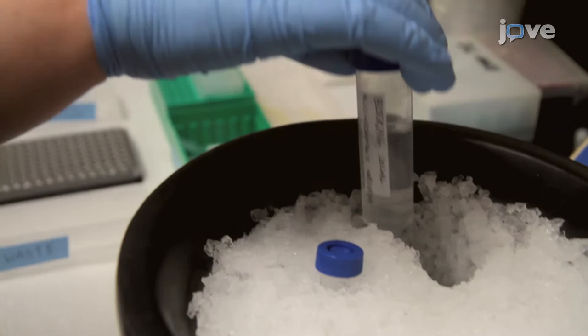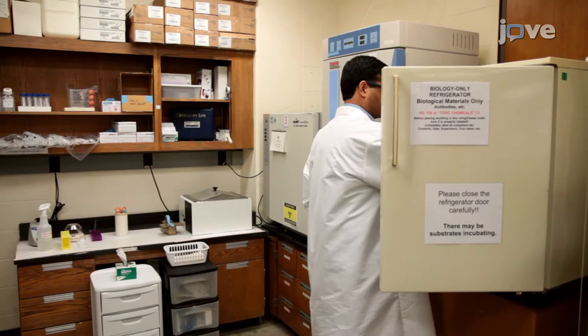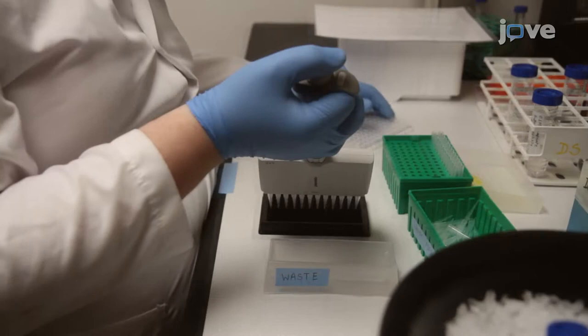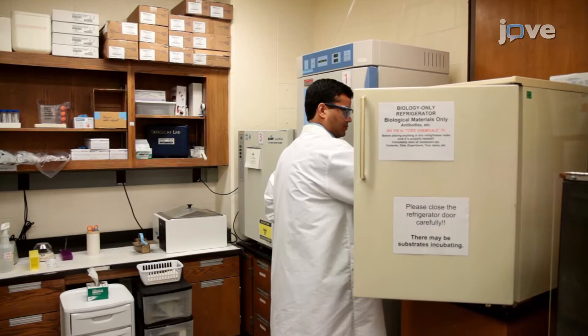After blocking the cells according to the text protocol, apply 100 microliters of primary antibody solution to each well. Cover the plate and incubate at 4 degrees Celsius overnight. After washing the cells three times for 7 minutes each, apply secondary antibody, place the cells in the dark, and incubate at room temperature for 90 minutes. Following another three washes, cover the plate and store it at 4 degrees Celsius until imaging.